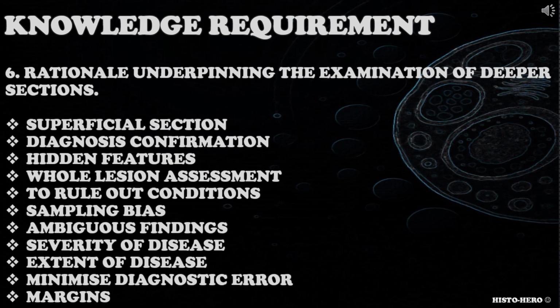The sixth knowledge requirement is rationale underpinning the examination of deeper sections. Candidate needs to have the knowledge and understanding about the rationale behind examining deeper sections. You could ask the candidate to explain, what is a deeper section and why would it be requested, what the importance of deeper section might be.